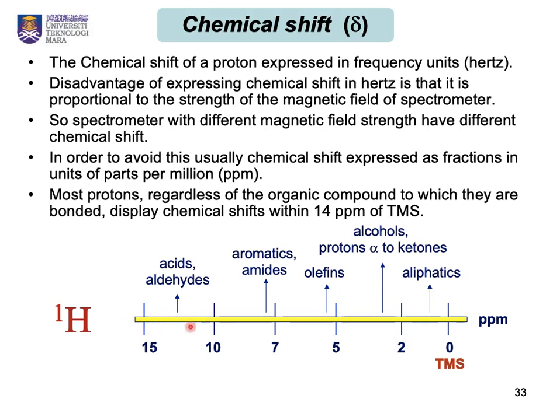You can remember that the ppm NMR scale starts from 0 and goes up to 14 or 15 parts per million in the case of organic compounds. This x-axis tells us the frequency of a particular proton. We are only interested in protons, meaning hydrogen.